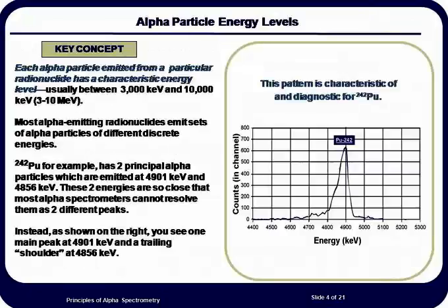Alpha particles emitted by the nucleus have a characteristic energy. For most alpha emitters, this energy is between 3 and 10 million electron volts. Alpha emission by the nucleus can result in alpha particles of different energies. Only one alpha particle is emitted per decay of the nucleus, but each decay can result in an alpha particle of a different energy. This is because any group of 2 protons and 2 neutrons within the nucleus can form the alpha particle that is ejected.